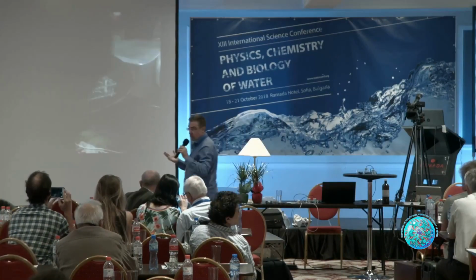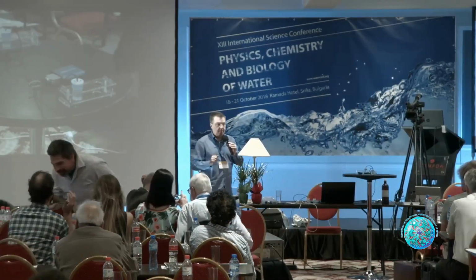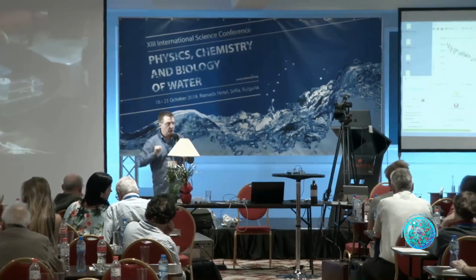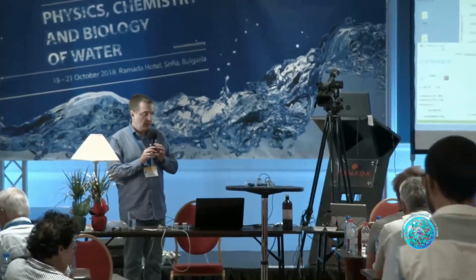Well, this more or less shows the cases we quite frequently have, a practical request, concrete technology, and a more or less clear result that we see finally. Okay. Any question to this part? Because here, you see, it's a little bit different usage. In the first case, we ran in the classical way, using frequency analysis. In this case, we consider the whole system as a non-stationary system and say, well, the impedance is changing in time. Impedance is the dynamic response that we're measuring. We can measure with statistical methods.